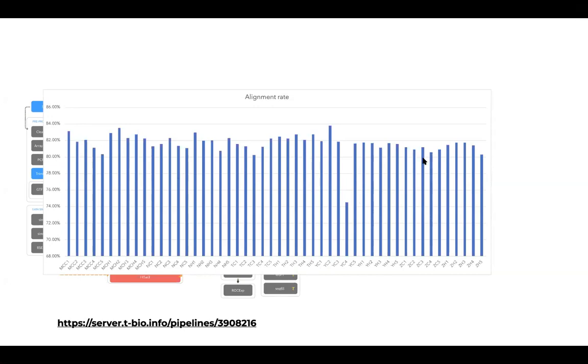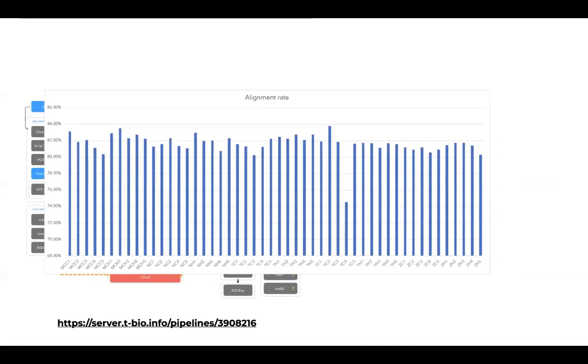So, depending on how accurately you want to look at the data, you would expect that the quantification normalization, for example, if you use FPKM or something like that, would actually account for that, right? Because this number of total reads aligned to the reference is going to be incorporated in FPKM. So another consideration here.